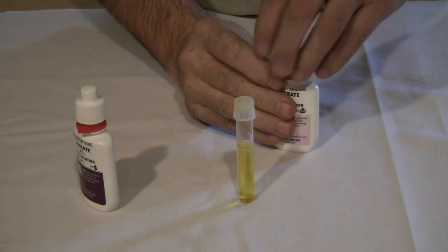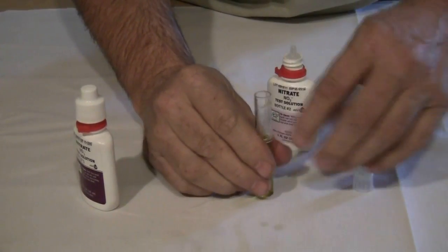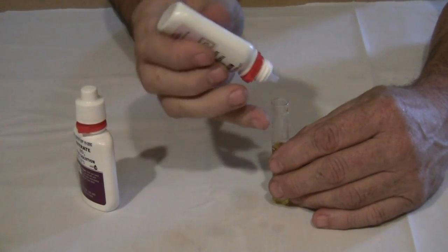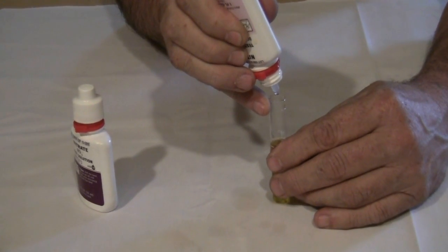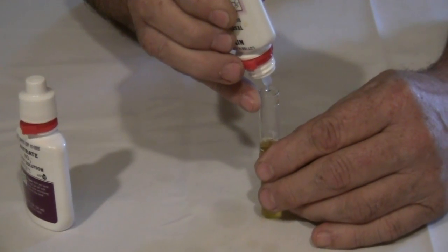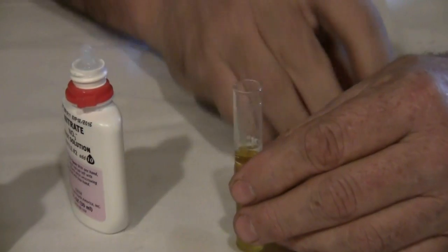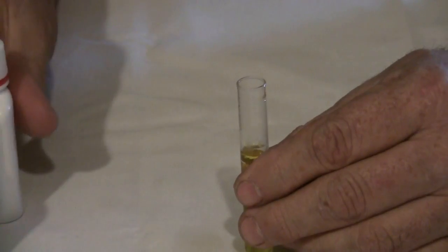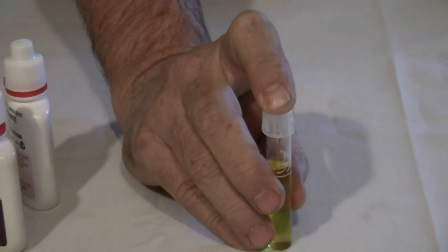We then take solution number two and add ten drops. One, two, three, four, five, six, seven, eight, nine, ten. Now recap and shake vigorously for one minute.